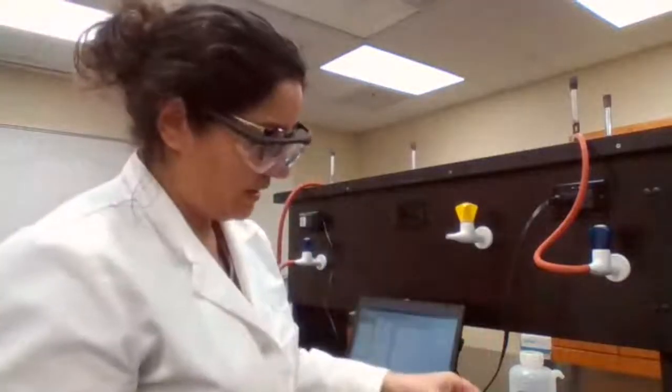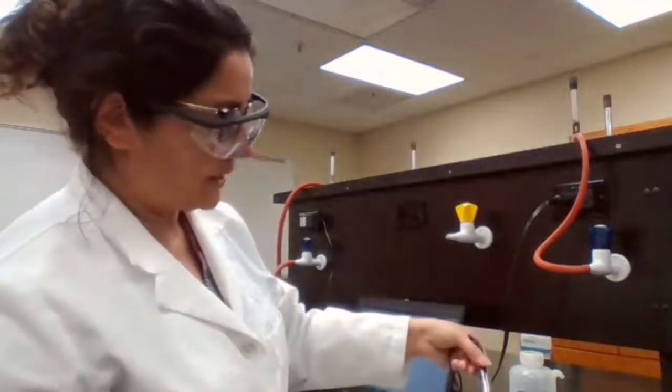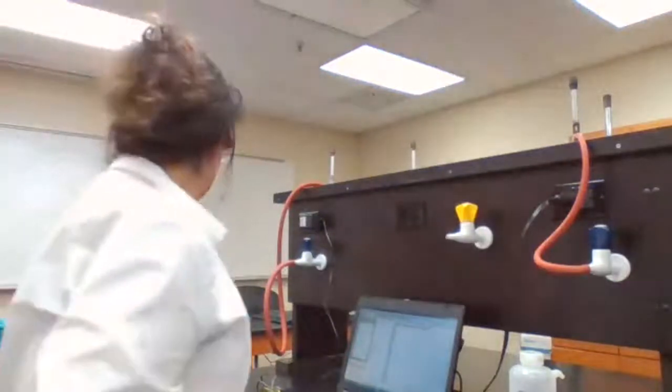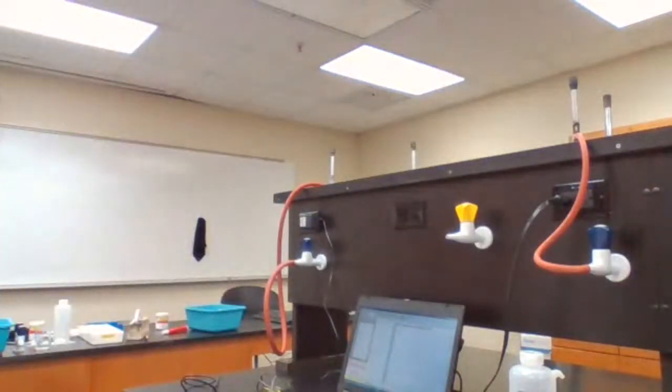The solubility of the potassium nitrate is much higher. It's very high. So even at room temperature, 40 grams could dissolve, it looks like it, but we are going to wait. And if it doesn't work, I go get ice. Let me ask for some ice.